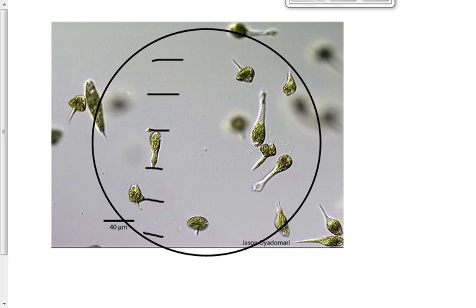Again, size estimation. Remember, always go in the longest dimension. So if we were looking at whatever these are, this would be the longest dimension, and I would say that 1, 2, 3, 4, 5, 6 fit across the field of view. 400 over 6. Any questions before we go over there?